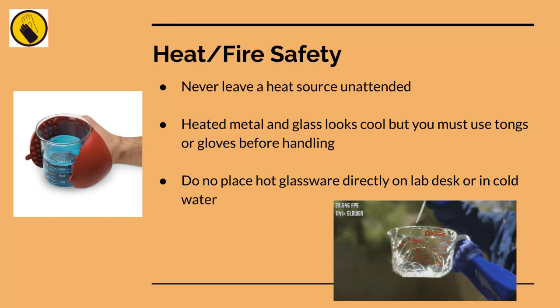It explodes, okay? And I don't want any kind of glassware explosions in my lab. Especially if someone next to you decides that for this 1 second while the glassware is exploding, they take off their goggles to scratch their eye, and now they've got glass in their eye. So do not place hot glassware on the cold countertops or in cold water. That's a bad situation.